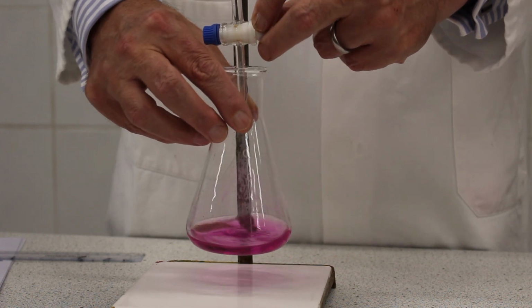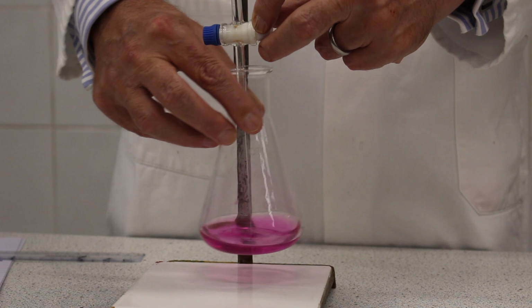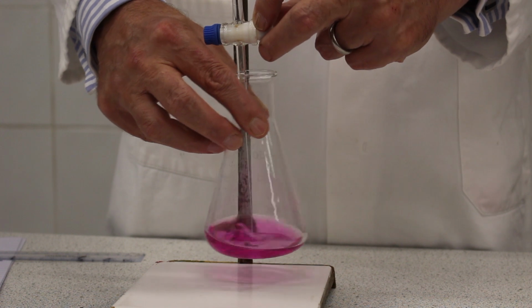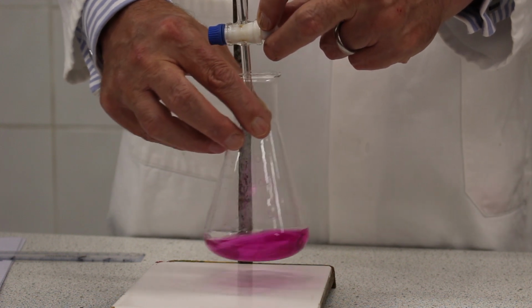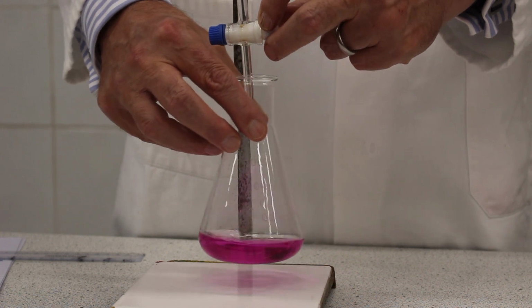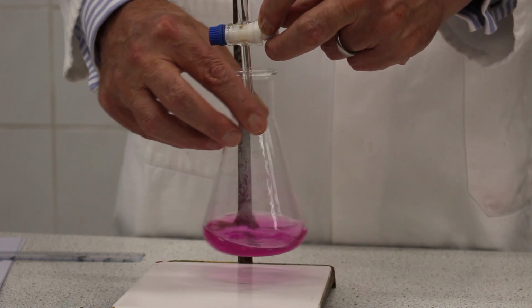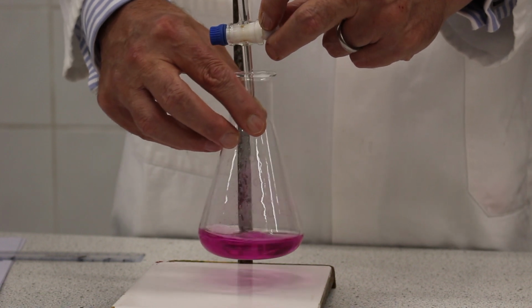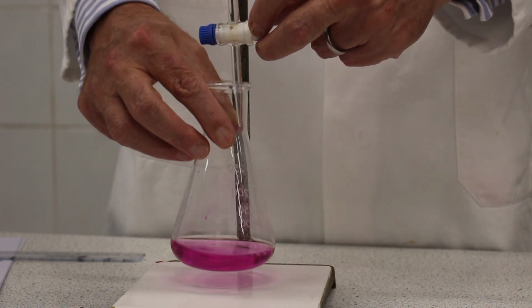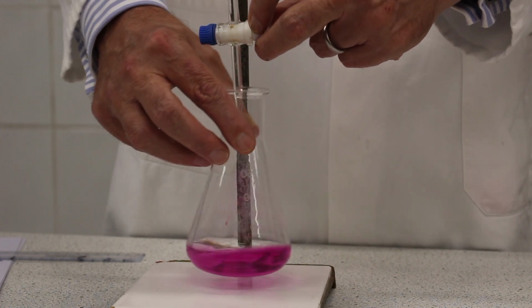Now the alkali and indicator are placed in a conical flask, and you can see that the indicator has changed the solution to pink, and that's because we've used the indicator phenolphthalein, and that indicator is pink in alkaline solutions and colourless in acidic solutions. So Mr. Firth then adds the acid carefully using a burette. To do this, he's just opened up the tap and he's adding the acid from the burette to the alkali and indicator, and he's swirling the flask to make sure that the acid is fully mixing with the alkali and the indicator.